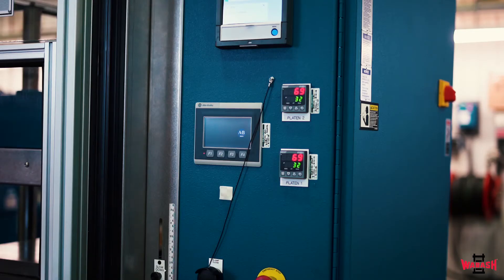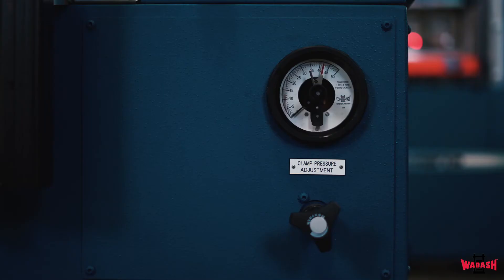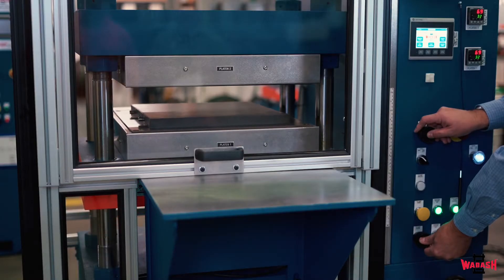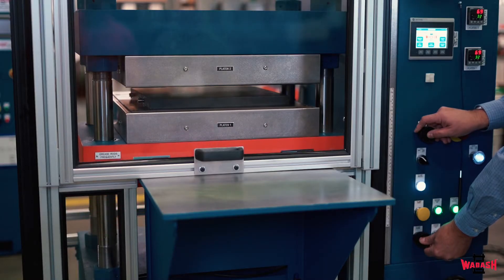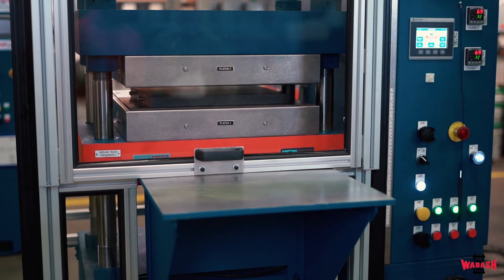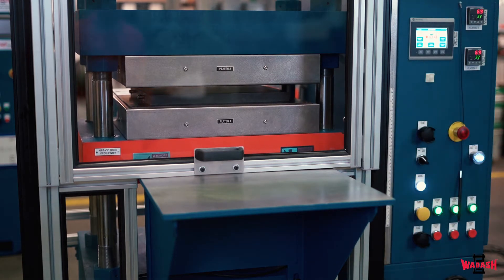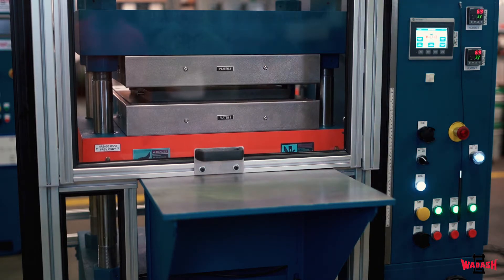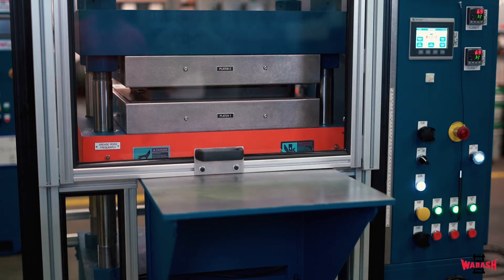The temperature of the platens is set on our 1/16 DIN discrete temperature controllers. The press is set using the adjustable analog gauge and manual relief valve. The clamping force of the press is 8 to 50 tons, which is well above the required 500 psi required to mold the four 6x6 samples typically cured with this press during the ASTM D3182 procedure.